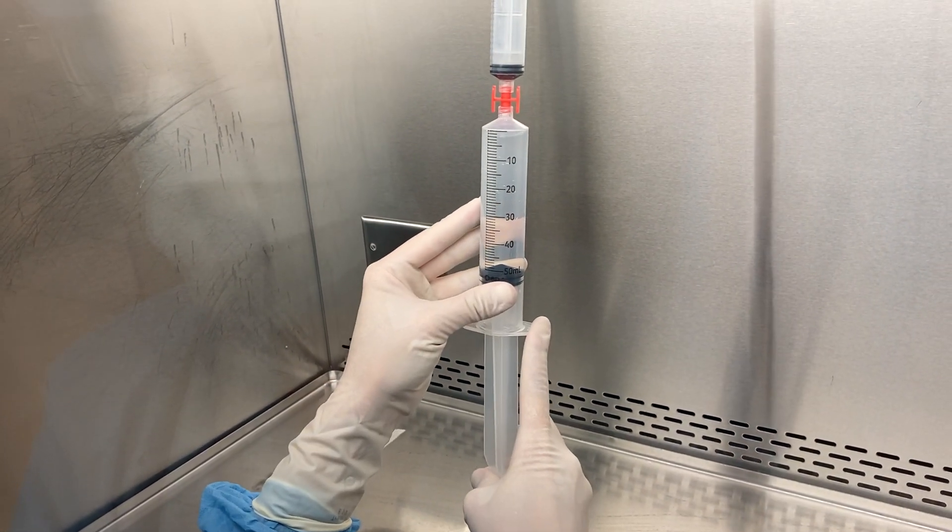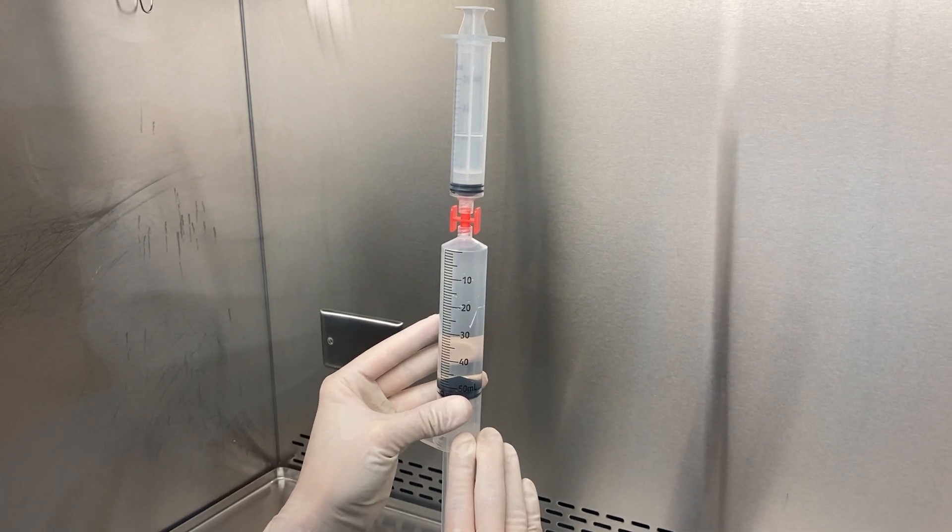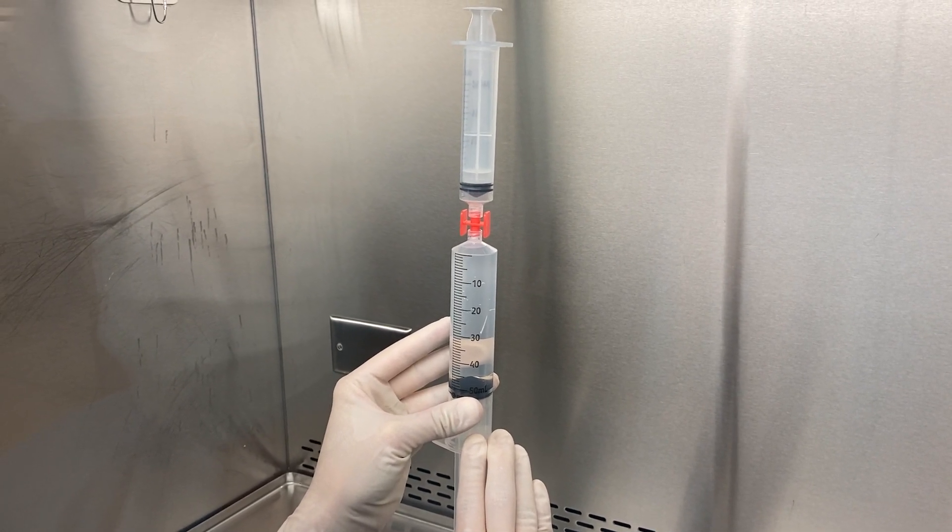Now carefully and gently I can push up on the syringe to expel my excess air.